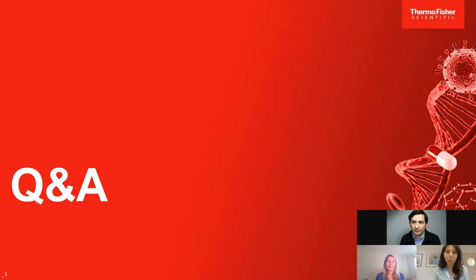Thank you. Okay. We're getting down to the last couple of questions, so I'll just remind our attendees, if you'd like to ask any final questions, please do so. I've got another request for a comment here. Thanks for the wonderful presentation. The comment is about the particles assembled in arrays. The conclusion was that secretion of the particles increased, but didn't the transfer into the membrane vesicles get interrupted? And the particles need to be inside for secretion. Is this correct?